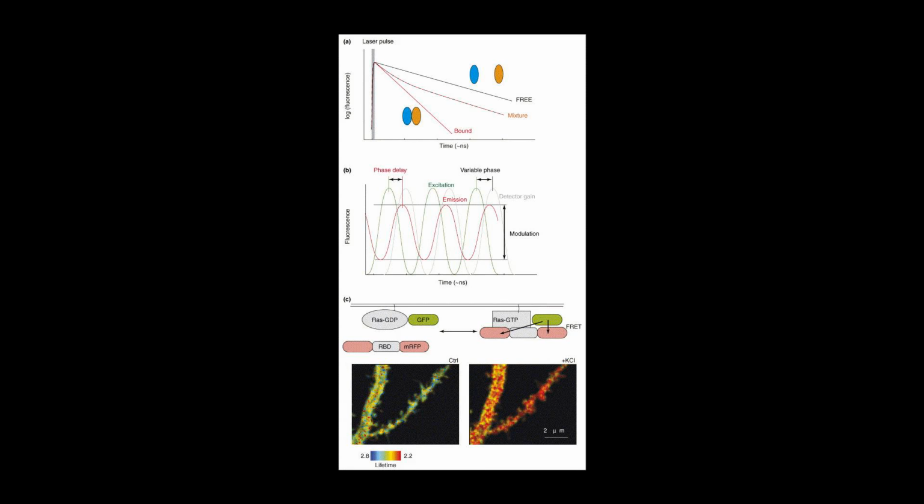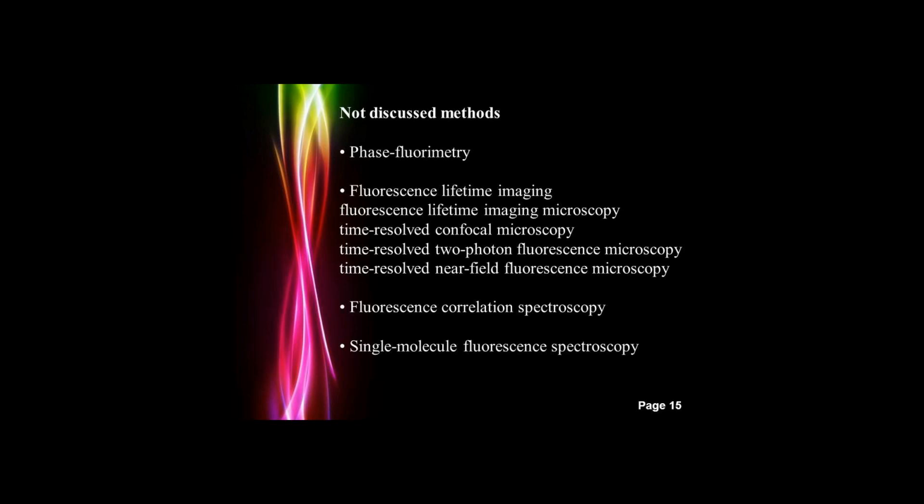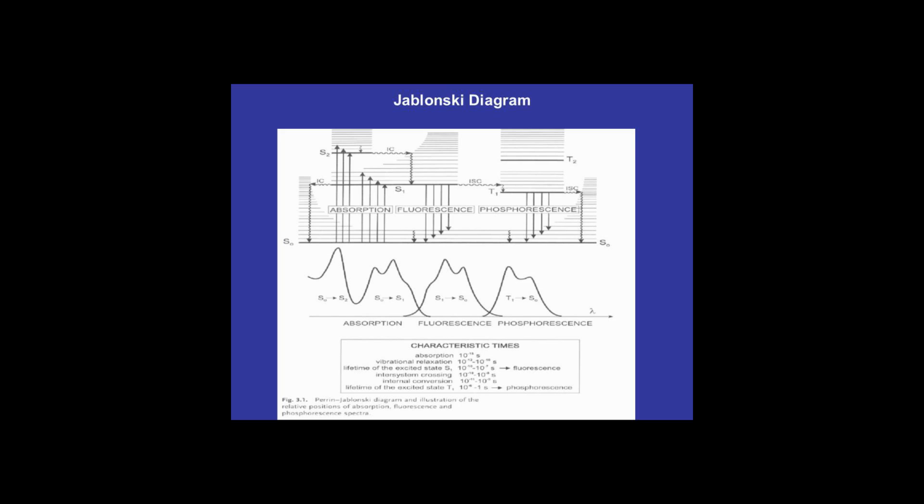The analysis is performed by integrating the decay curve in equal time intervals, delta t: d_0 equals the sum from i equals 1 to k/2 of I_i delta t, and d_1 equals the sum from i equals k/2 to k of I_i delta t.